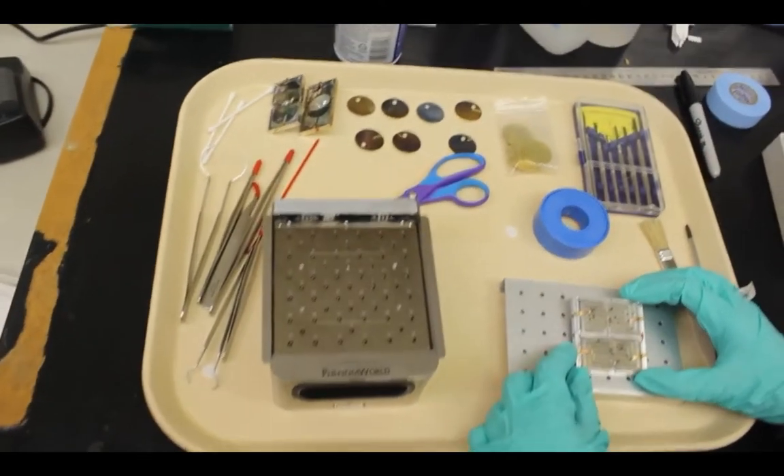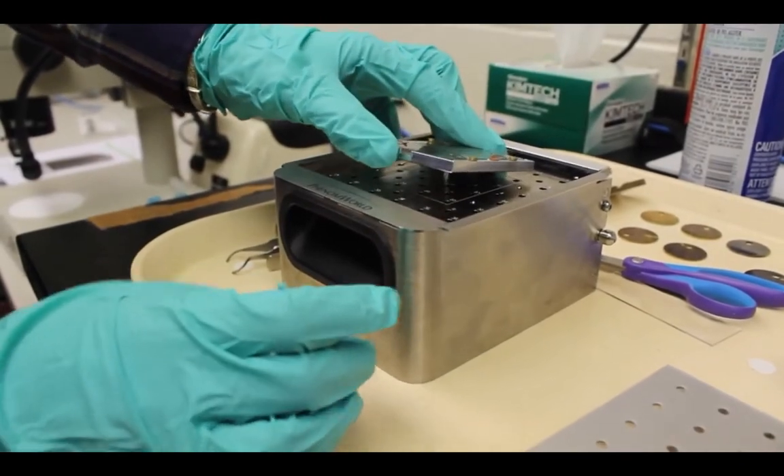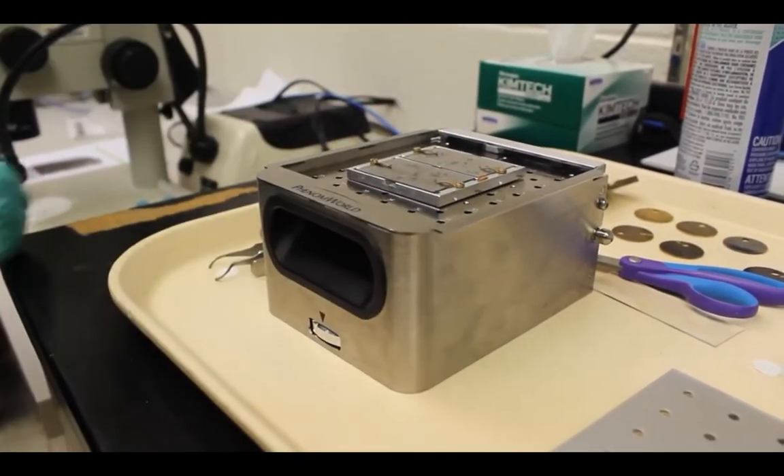After you've prepared your sample by coding it appropriately, mount it into the SEM sample holder with the appropriate attachment like this.